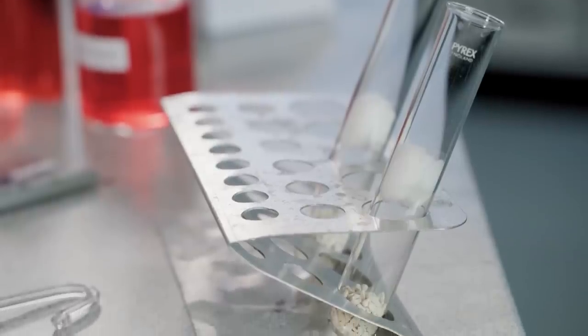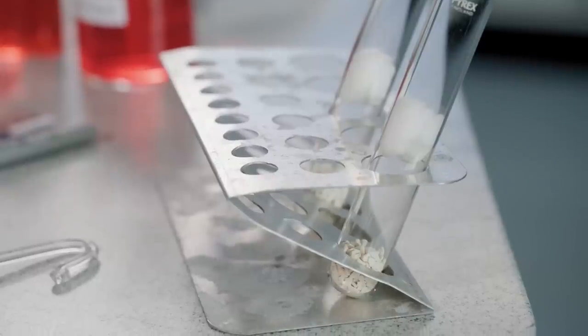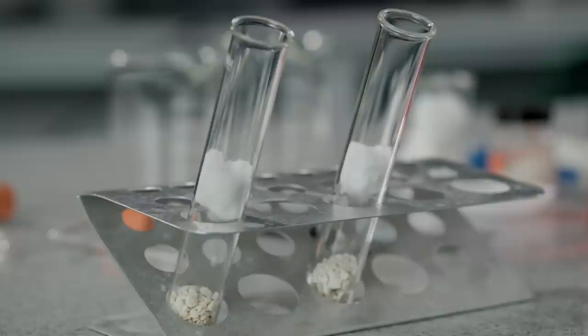Collect the boiling tube with some soda lime granules held in place with cotton wool at the top. The soda lime's function is to absorb carbon dioxide in the tube. The cotton wool function is to protect you and the organisms during the experiment.